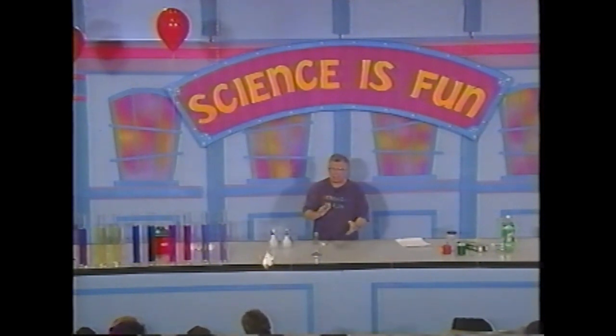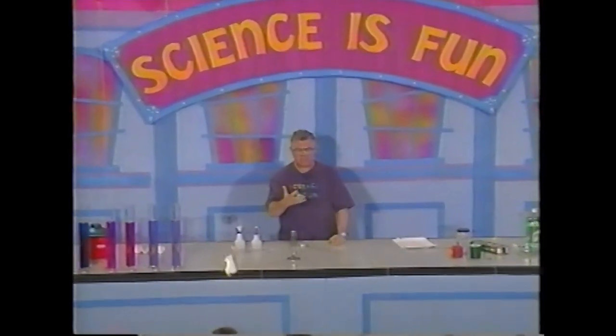Did you see it better with the lights on or the lights off? That's something we should remember when we're looking for the release of energy in the form of light. We should do the experiment indoors, not in the sunlight and in a darkened room.